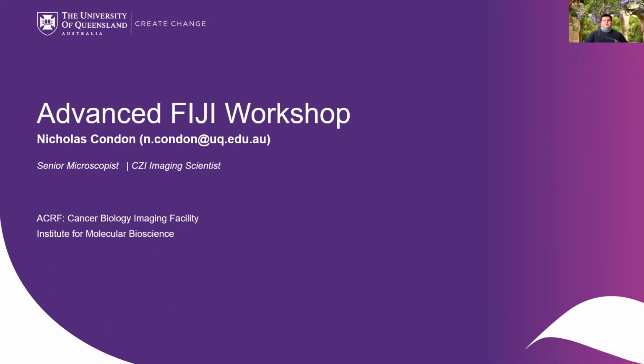This workshop is called Advanced FIJI and we'll go through some steps to automate processes, whether it's using plugins or using batch processing or scripting in the open source program FIJI.